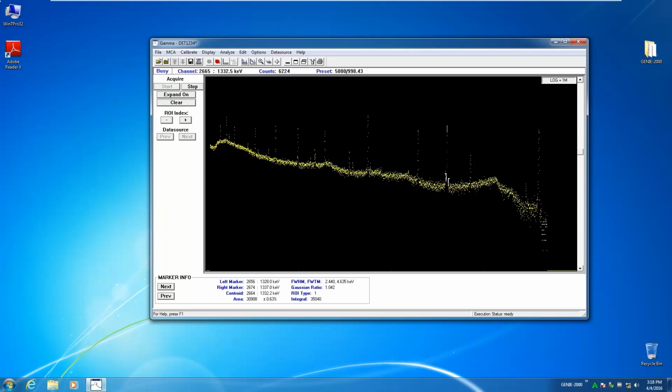If the spectral peak being evaluated is confirmed to appear at the desired channel location, allow the spectral data acquisition to continue for approximately 1,000 seconds. Our demonstration will resume shortly after 1,000 seconds has elapsed and the spectral data acquisition has been manually stopped.